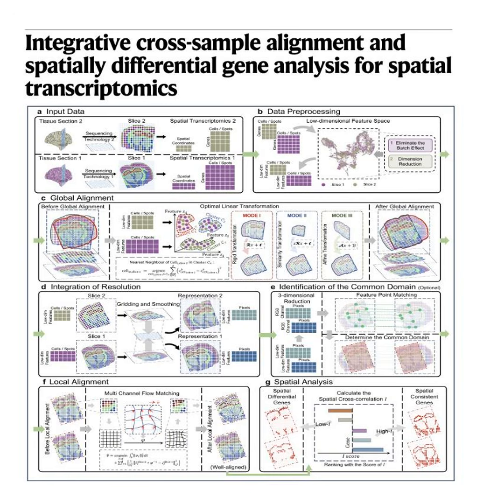Then mode 2 is similarity, which adds uniform scaling. Okay, to fix overall magnification differences if one slice was zoomed in more than the other. Exactly. Makes sense. Spin it and zoom it. But mode 3 is where it gets sophisticated. It's called affine alignment. Yeah. Affine alignment is crucial because it accounts for anisotropic scaling and shear.